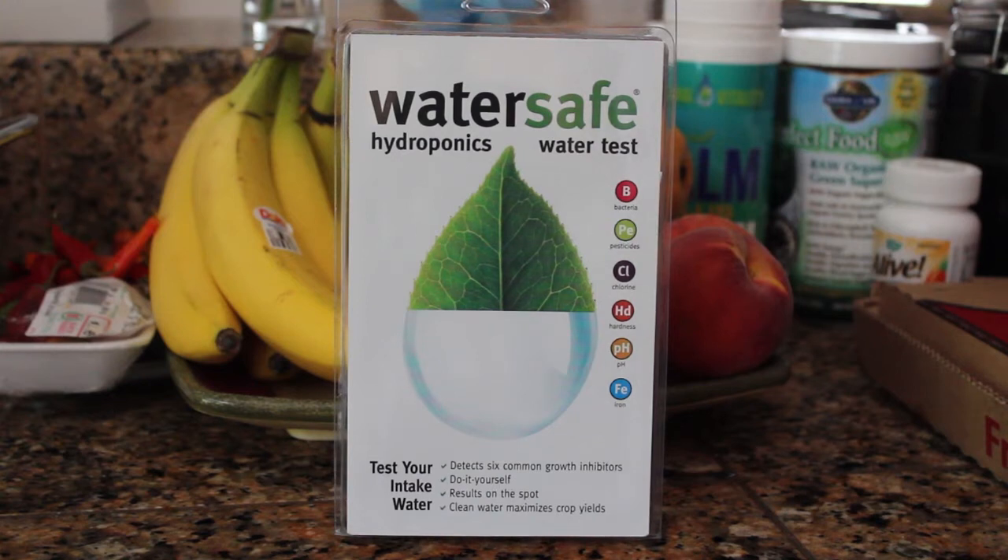The reason I didn't like mine originally was because the PPM was too high. But what this test does — and it only costs $30 if I recall — is it tests for bacteria, pesticides, chlorine, the hardness of your water, the pH, and its iron content. So these are all really great things to know, and for $30 it's a steal. Let's go ahead and open this thing up and take a look at what my water quality looks like and see how accurate this thing is.